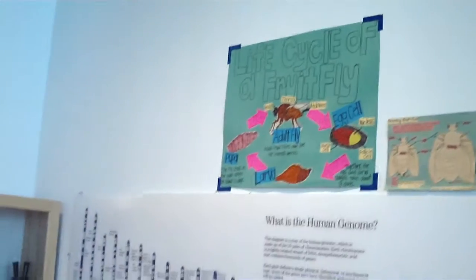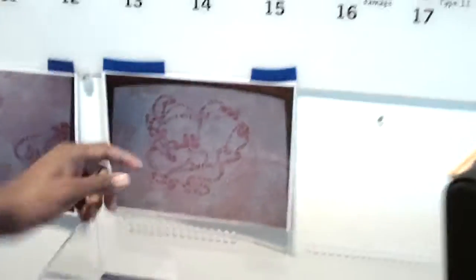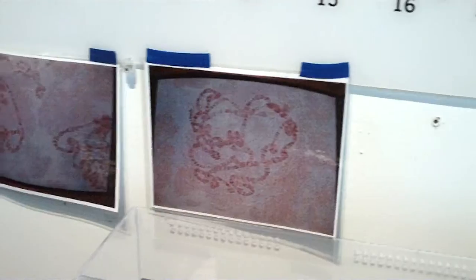These in the back here is a giant chromosome. It's a fruit fly at the larvae stage - you dissect the head and you find chromosomes, the DNA chains and how it's structured.